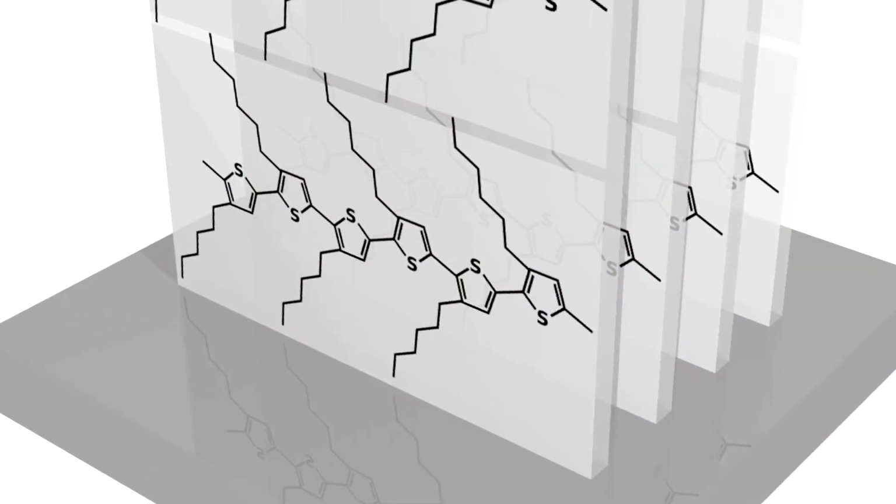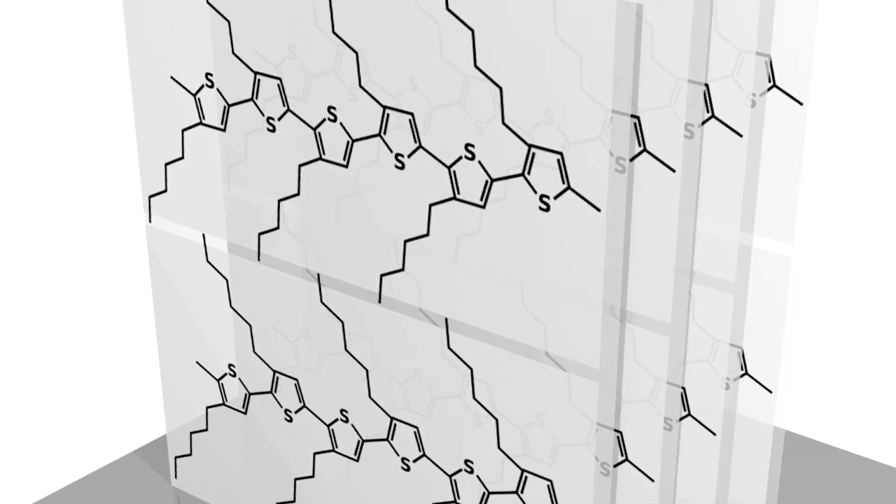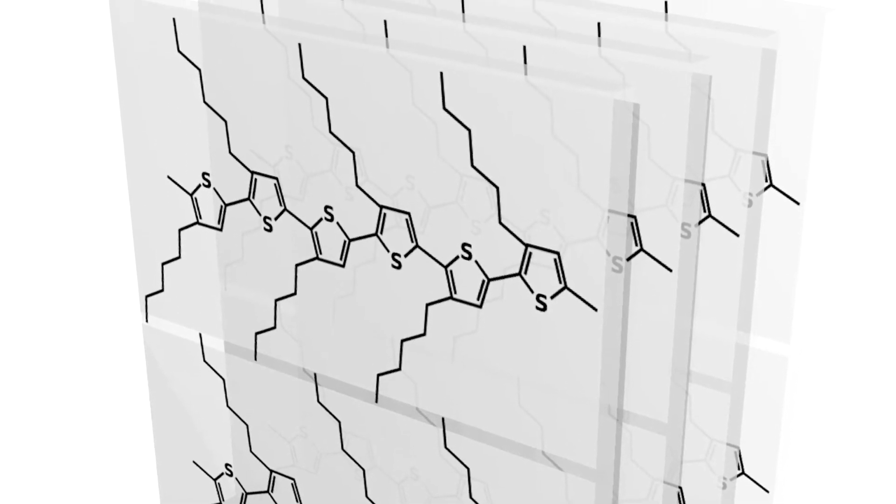One example of a project here in the CFN where we used both small angle and wide angle X-ray scattering was a solar cell project. We were looking at organic photovoltaic materials, which essentially are solar cell materials made out of polymers rather than something inorganic like silicon.